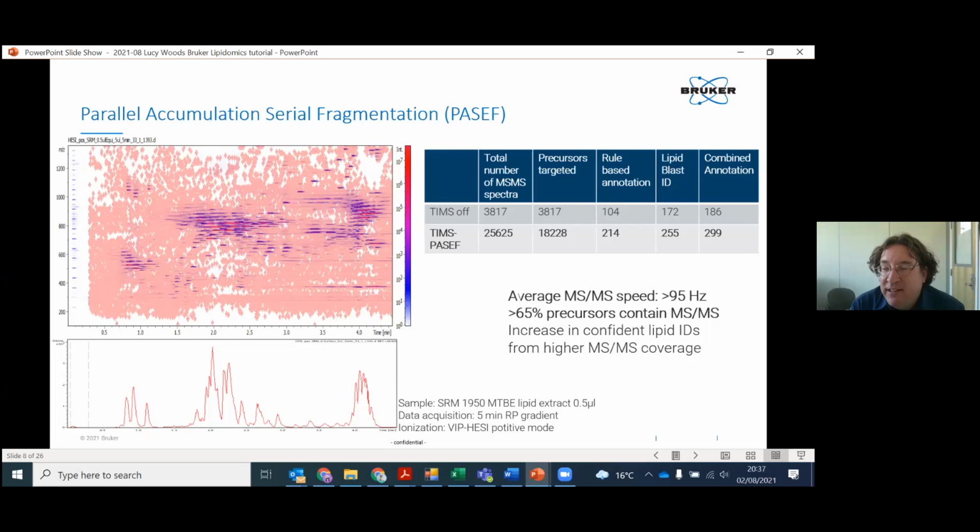Well, the idea is that you have four different parameters. You have LC retention time, you have the accurate mass, you have an MS spectrum, and you have a CCS value. Each comes with subtle windows of accuracy in the measurement. Can you combine these scores? And have you tried that? How close would those be to an alternative explanation? It's not something that we've tried, but it's something that we could discuss.